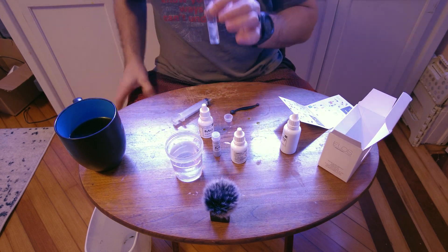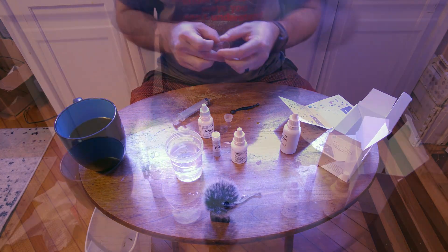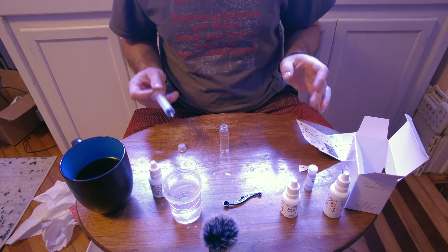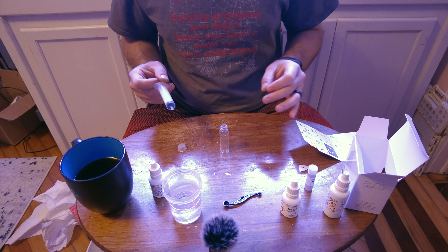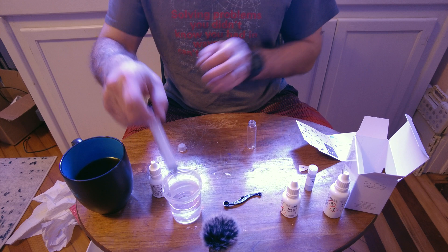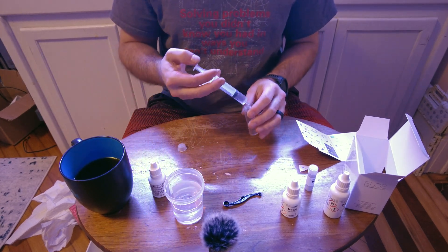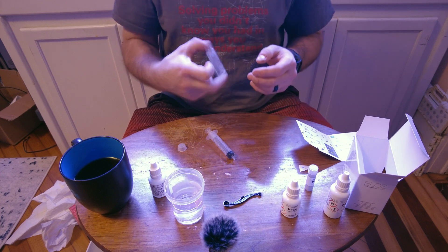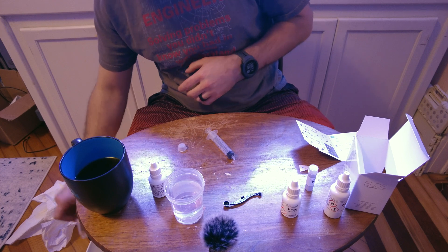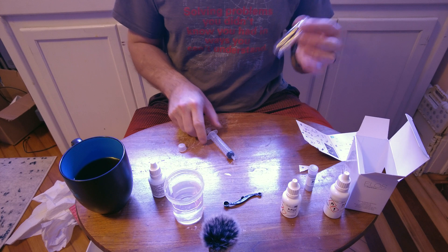We dumped out that first sample — that was 31 drops. There was a little oopsie between steps one and two that resulted in a spill, and the vial rolled off the table and cracked. So I've got a spare checker vial we're going to use. Luckily I didn't need to reuse it. The first step has no bearing on the liquid in the second step — you just need that number for the math.